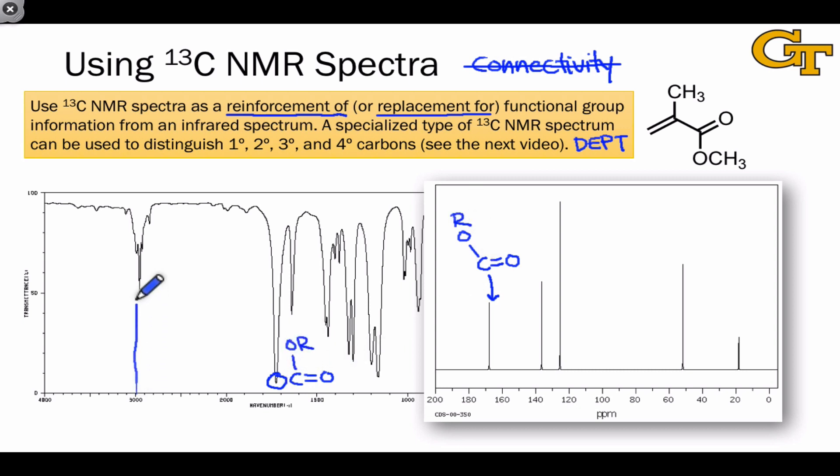Drawing the usual 3,000 wave number dividing line in the IR spectrum, we do see some character associated with sp2 CH stretches. And these are reinforced by the presence of alkene carbons in the carbon-13 NMR spectrum. Just from these considerations, we've identified what are really the two key functional groups in this molecule, the alkene, or carbon-carbon double bond, and the ester, carbonyl group, attached to an oxygen with an alkyl group attached.